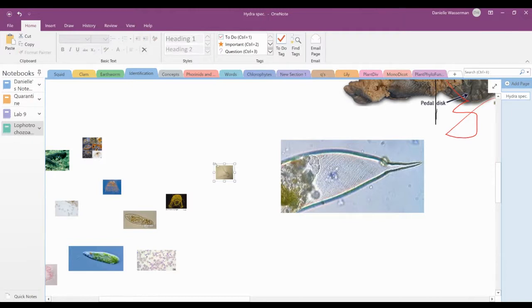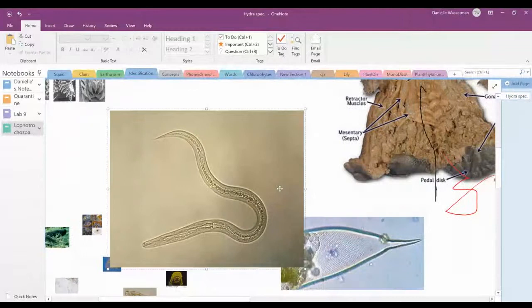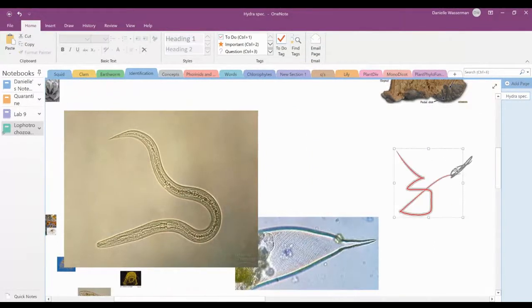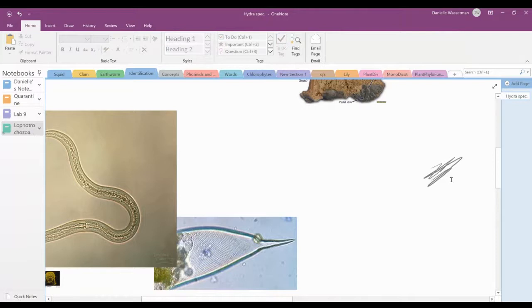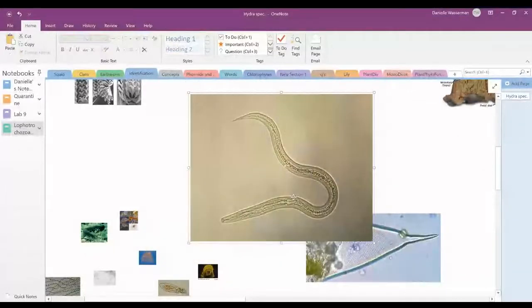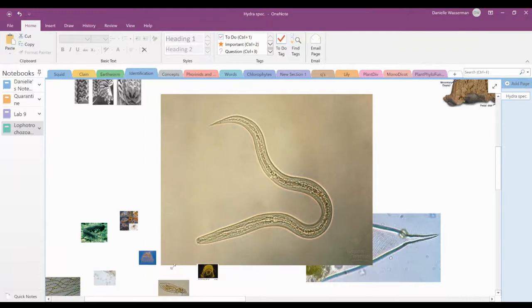Here's something else. You should be able to name the phylum. But I don't think you're going to get this. I think you're going to get a relative, because those are the ones that that instructor did a video on. Remember during the lecture on, spoiler alert, nematoda, you saw two videos. And one of them was on Ascaris lumbricoides. So you'll probably be shown an Ascaris. But like an Ascaris, this is also a nematode. And you should be able to tell that this is the mouth. That's the anus. There's no postanal tail.